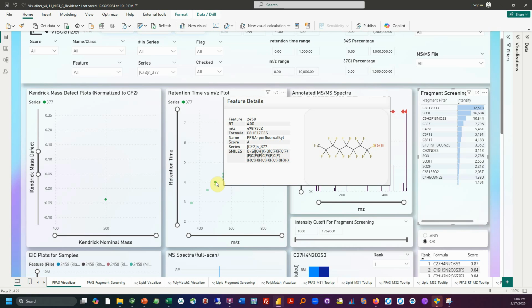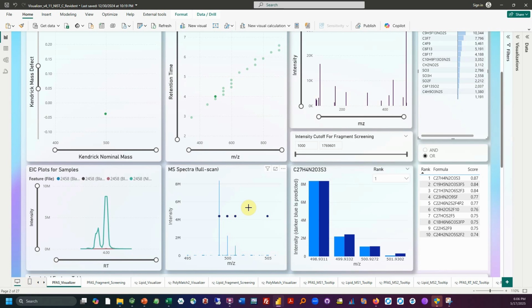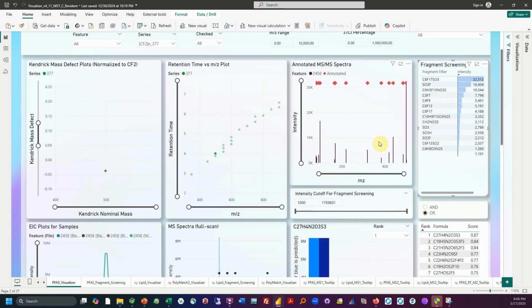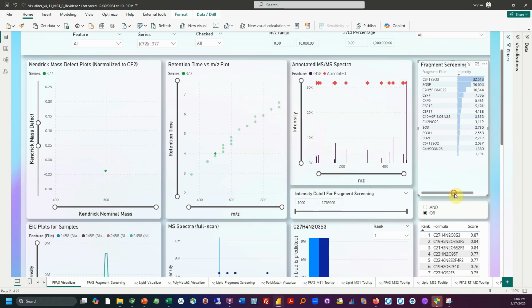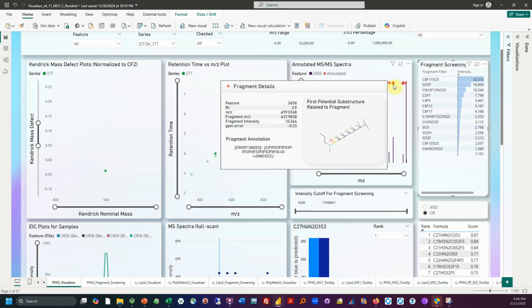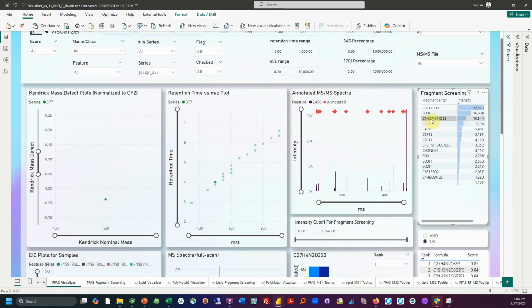That's good evidence. We also have this C9H5F13NO2S fragment, which may or may not be very useful to us. You can see that is at mass 437. So it's this one. So I'm not exactly sure what that mass is, but it does not match the structure that we're looking for. So that's something to keep in mind, and it's highly abundant.